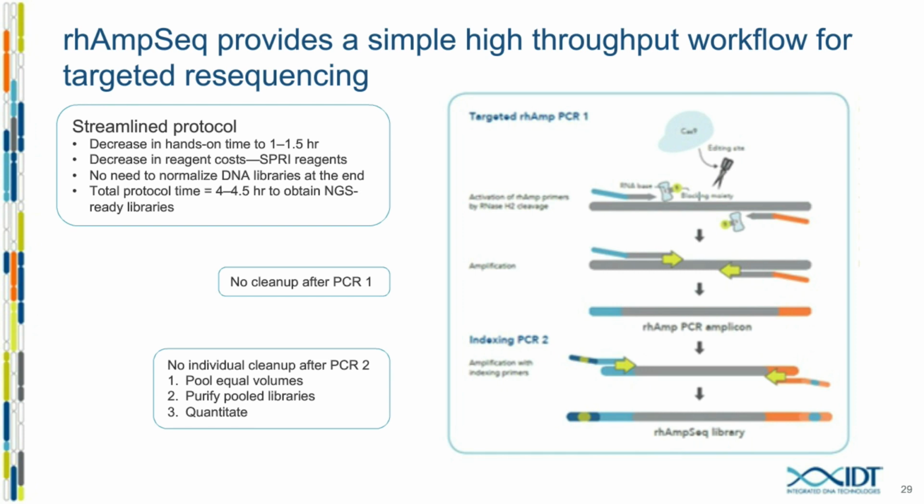I described earlier. So CRISPR panels are typically small, usually between 50 to 100 targets. So that being said, you have the ability to multiplex many samples in a single run because they are quite small.